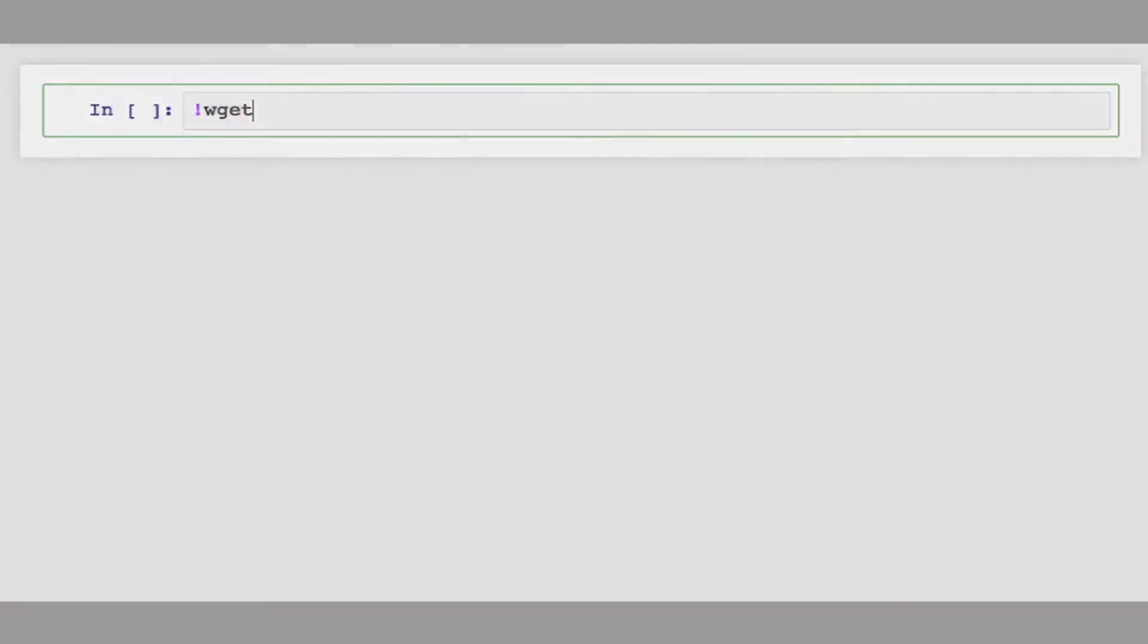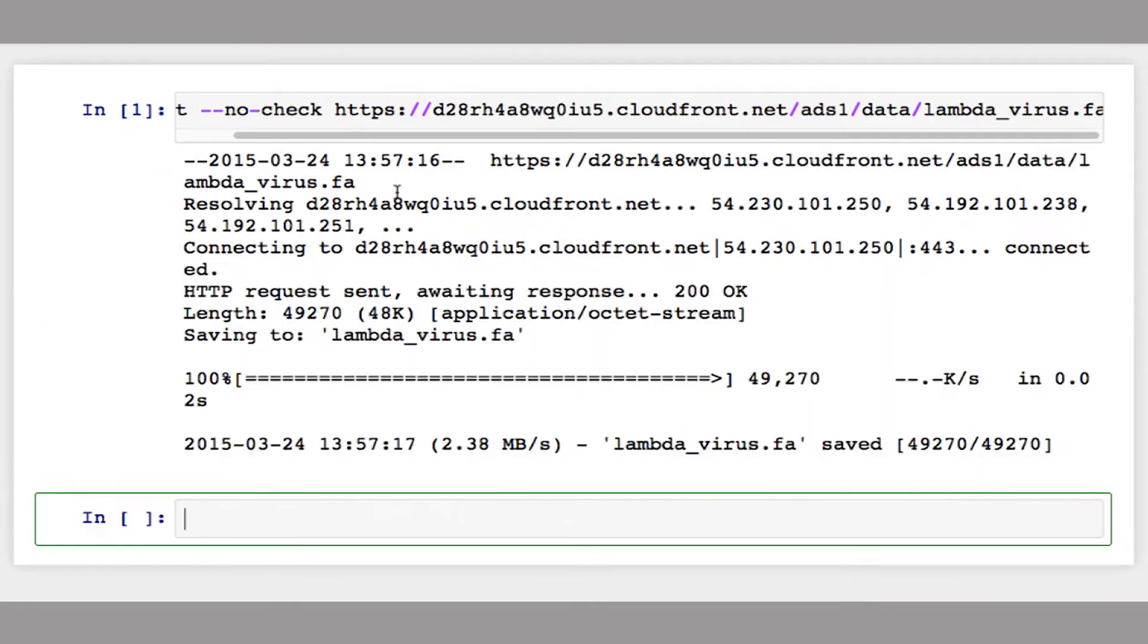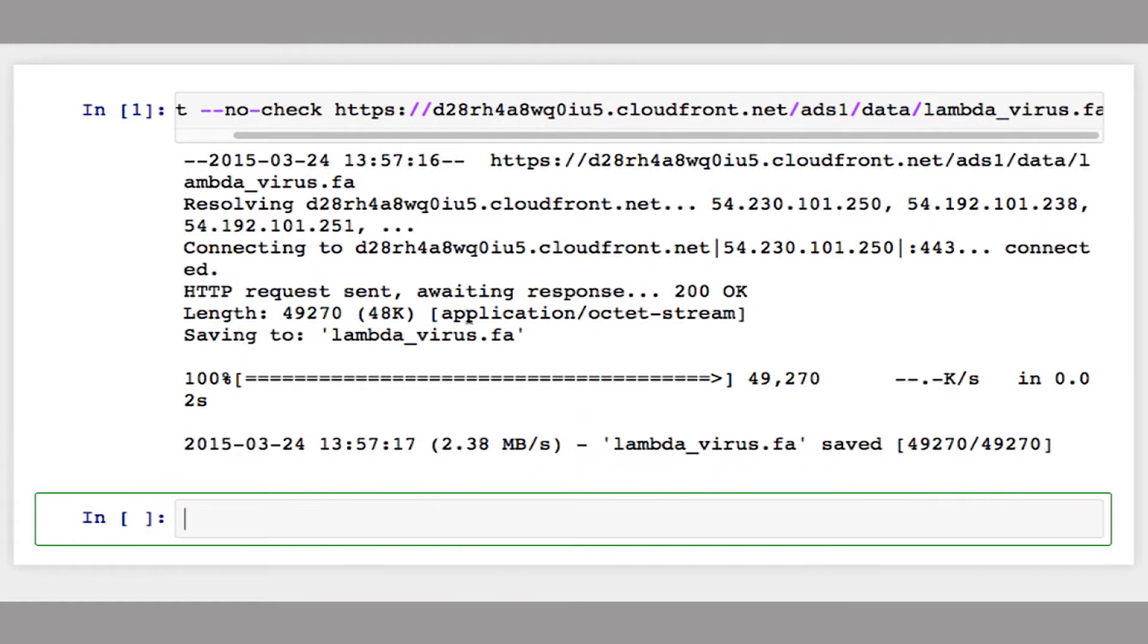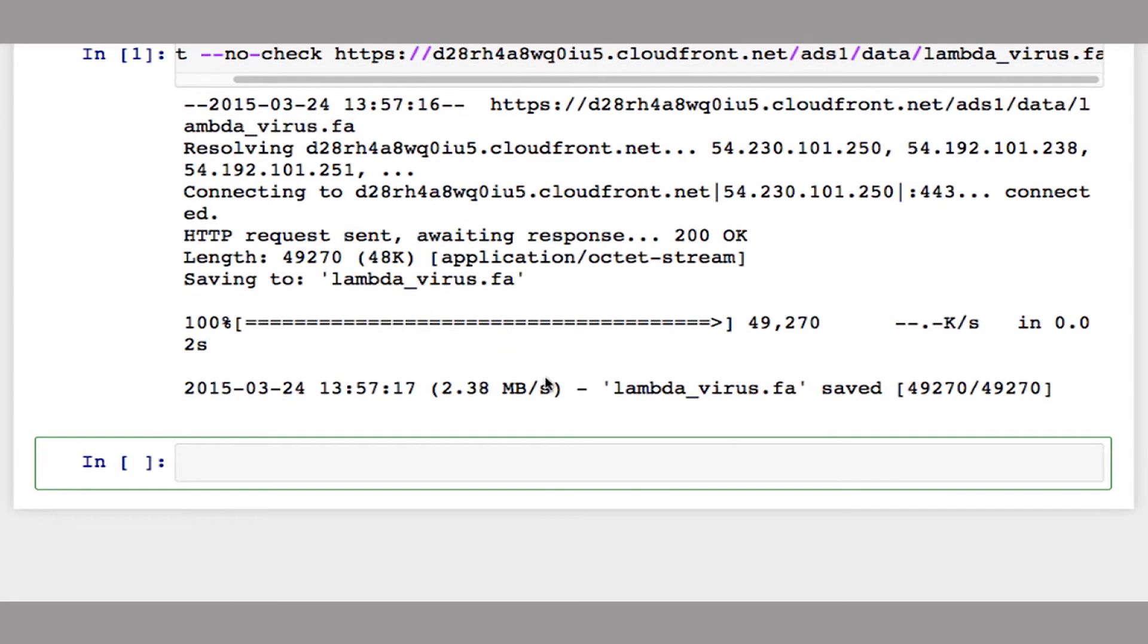So now I'm going to download this data set in IPython and process it. I'm going to use wget to do this. If you have the file downloaded, you can also just open it locally. But this will get it from the URL. So I'm going to do exclamation mark wget, no check certificate. And then I'm going to paste in the URL to the data set. And when I run this, you should see an output something like this. And then it says, the file is saved to lambda_virus.fa.